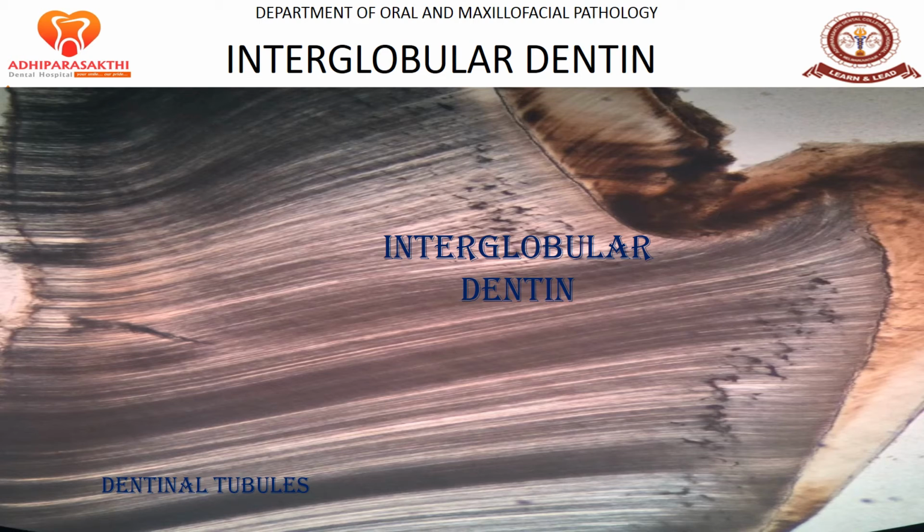This feature will be viewed as black color star shaped structures under the microscope. When viewed under the microscope, we can see small star shaped black color structures present in between the dentinal tubules. Those structures are called the interglobular dentin, and the dentinal tubules will pass through this unmineralized structure.